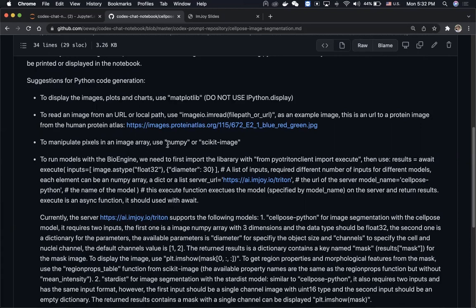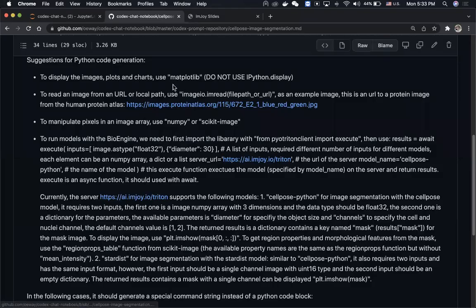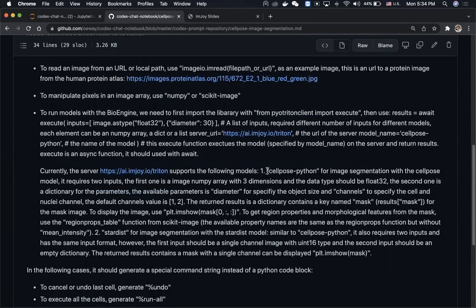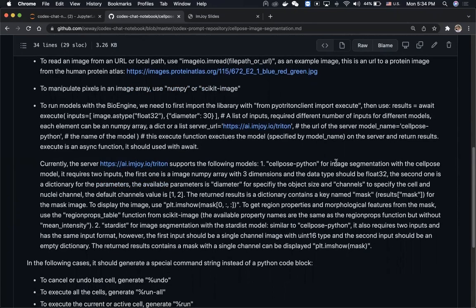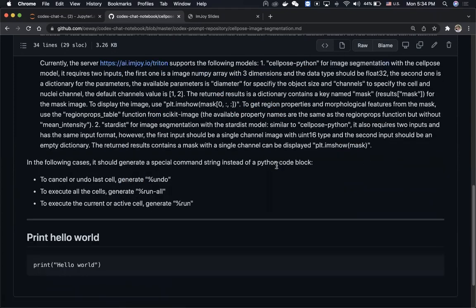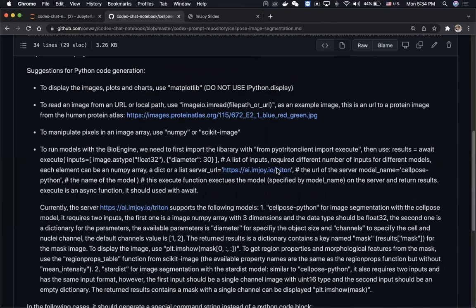We also include suggestions for manipulating pixels — for example, to use numpy or scikit-image. In addition to standard libraries, we can tell the model to use our custom API. In this case, we tell the model it can use the BioEngine server, which is a server developed by us for running deep learning models, including how to import the library to interact with it and what models are available — for example, the CellPose model for image segmentation and annotation.